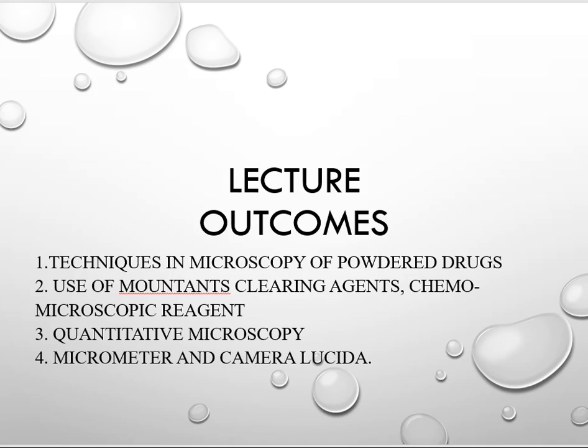In this video, we are going to talk about microscopical evaluation in detail. In the previous lecture, we had studied about the different types of drug evaluation. That is, we had enlisted it: physical, chemical, biological, and your microscopical evaluation. So here we are going to study about the microscope, the various agents that are used as a chemomicroscopic reagent or clearing agents. Then we'll look forward to quantitative microscopy, micrometer, and camera lucida.